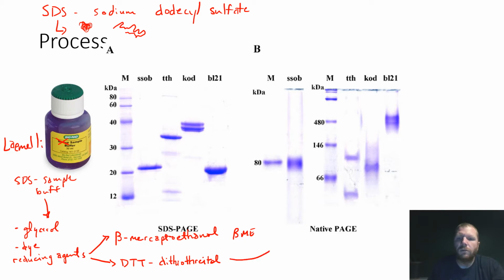What they are also going to do, in addition to smelling, is break disulfide bonds.